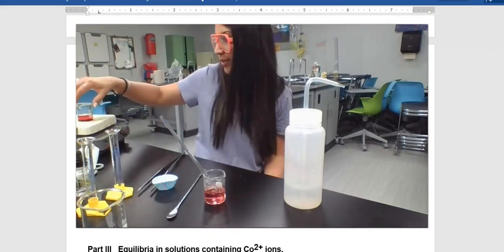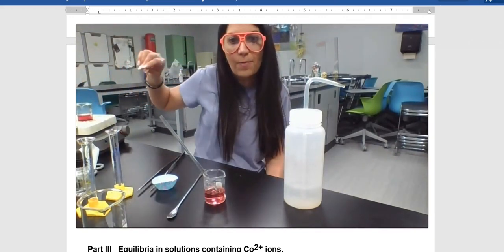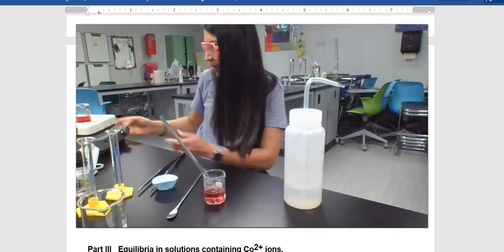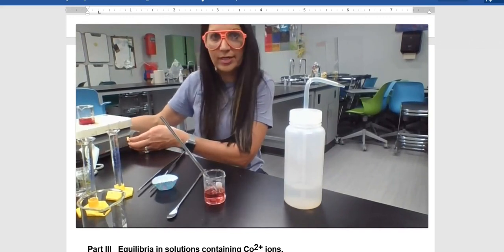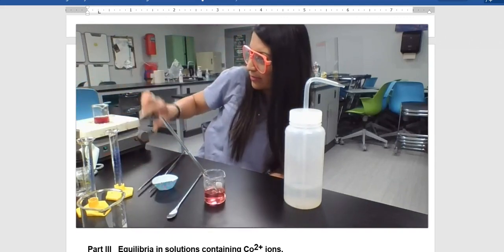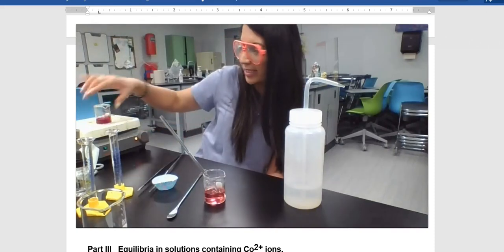I don't even need my beaker tongs right now because the glass didn't have time to get hot. I don't know if you can see this, but on the bottom, it's already starting to turn purple. It's starting to go back to a purplish color. Hold on a second. Let me see if I can move this closer so you can see, because this hot plate is warm right now. Looking good. Let me give it a little bit of a stir. The bottom of it is turning more of a violet, purplish color.